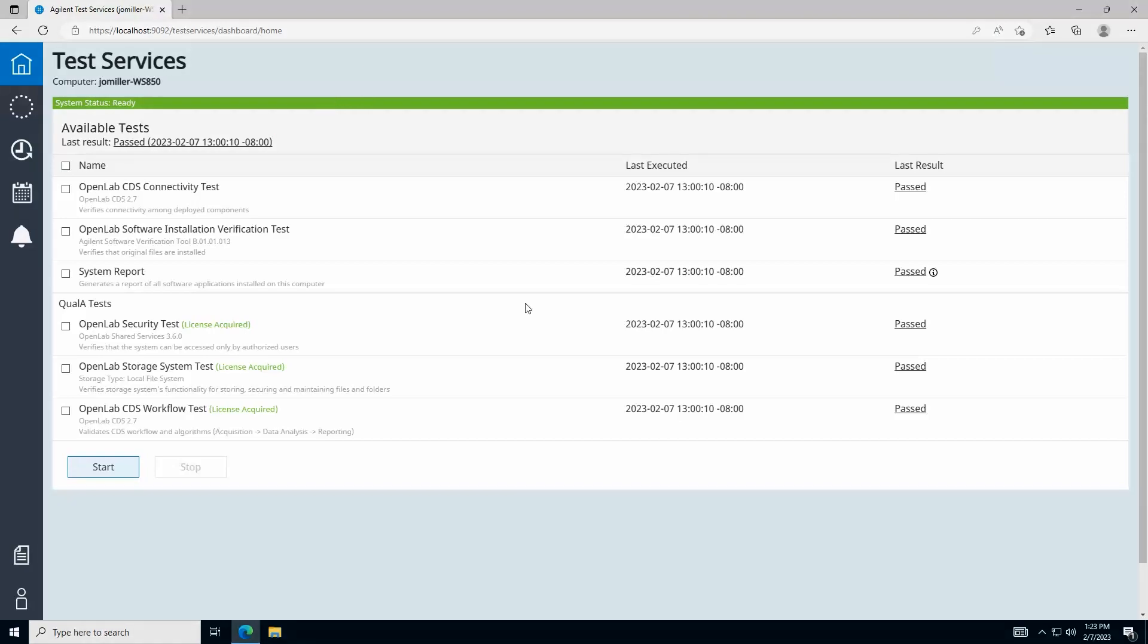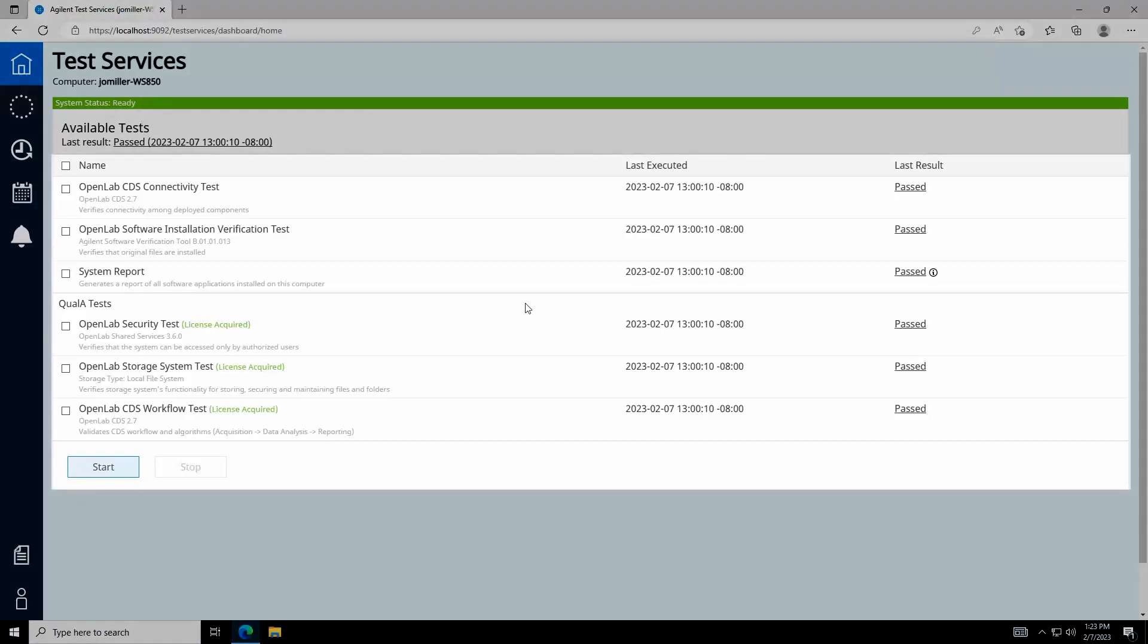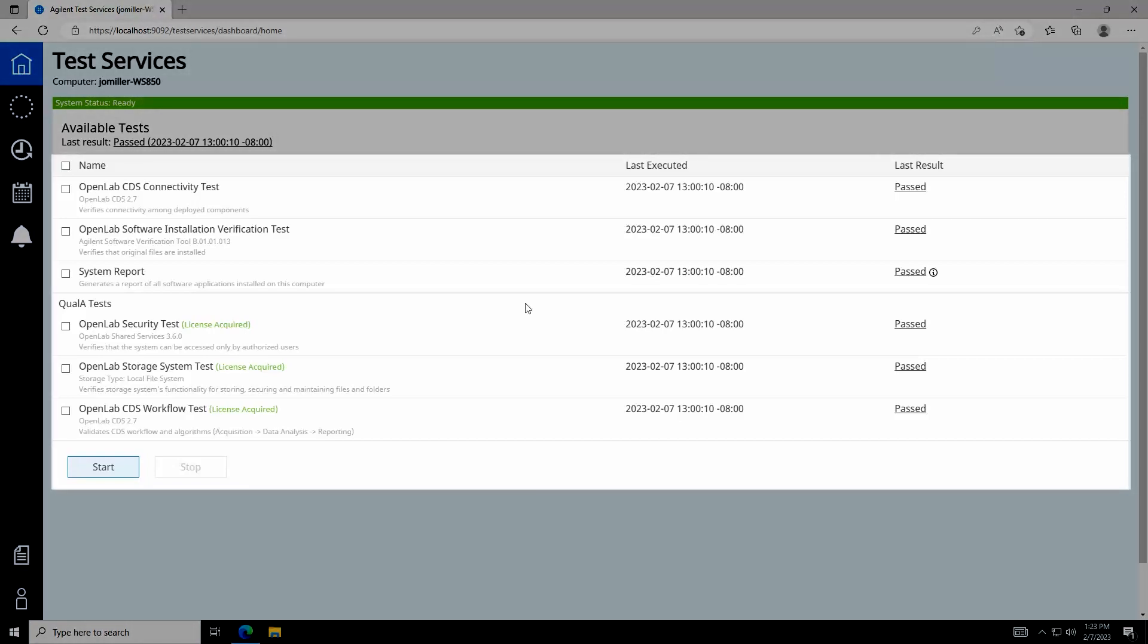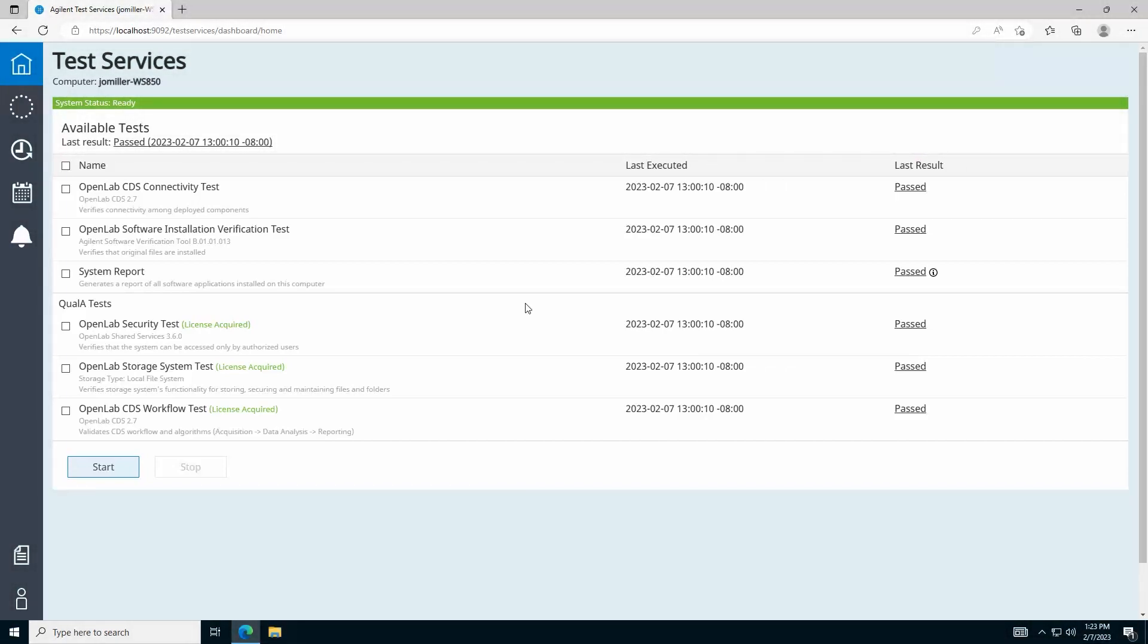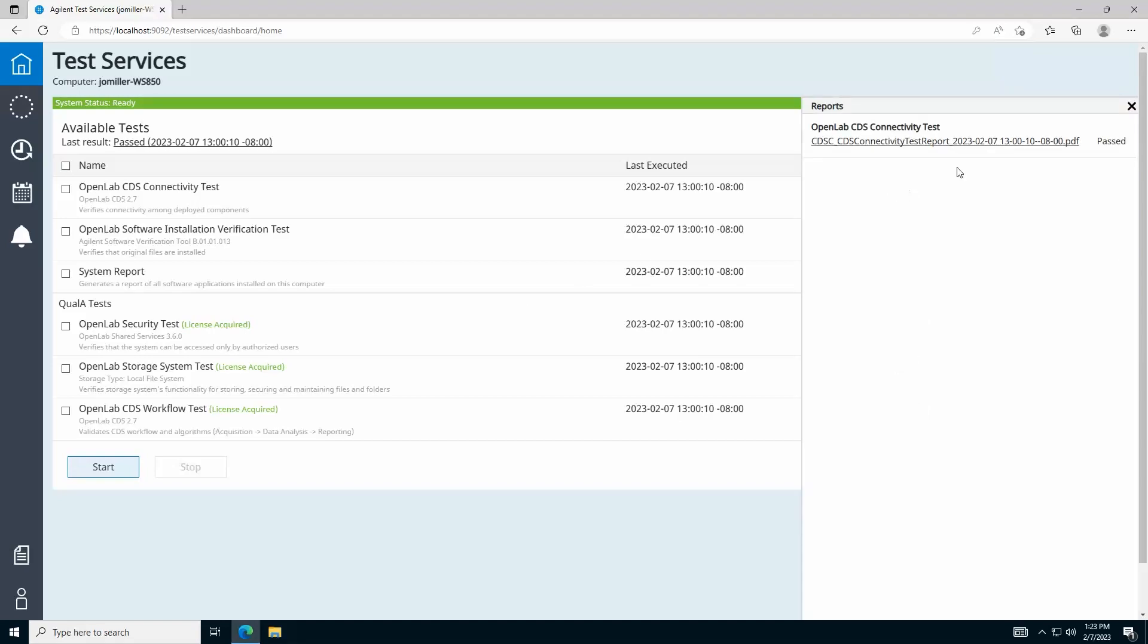Below this is the list of available tests in Test Services with their most recent execution date and last result shown to the right. You can quickly see information from the previous result by clicking the last result for a test to open the related report.